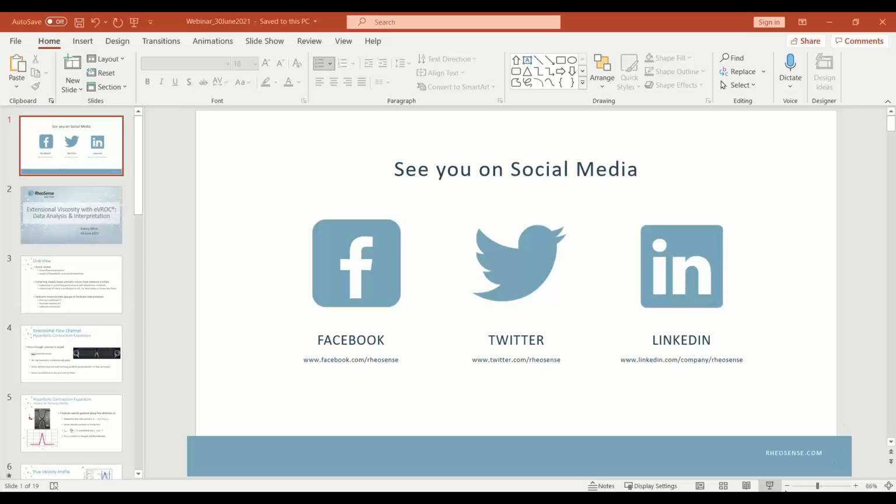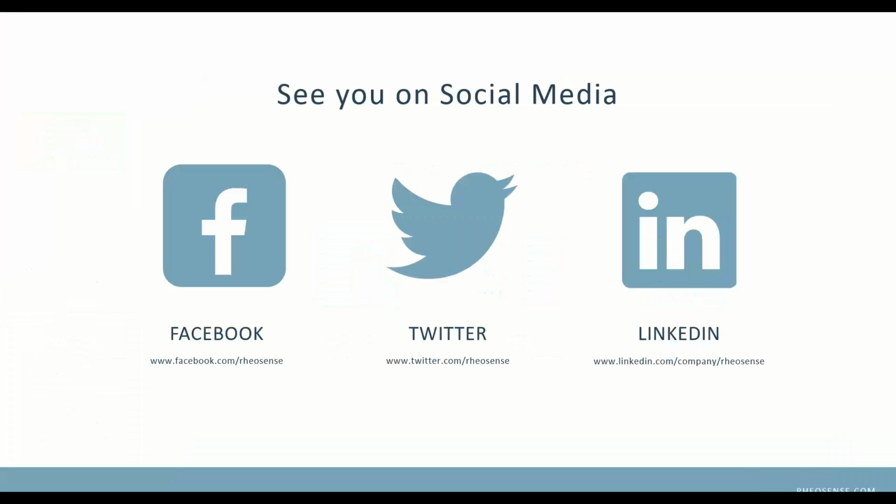Good morning, everyone, and welcome to our June webinar. It is part 2 of our Extensional Viscosity with EV Rock. This month, we're going to be investigating data analysis and interpretation.